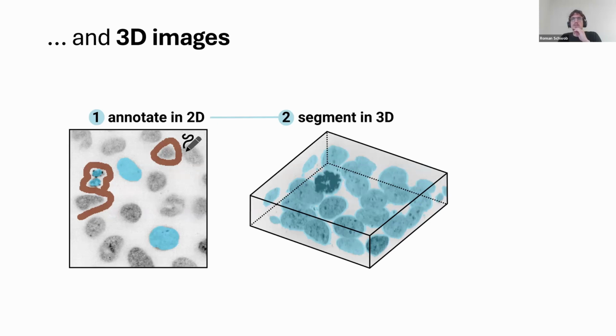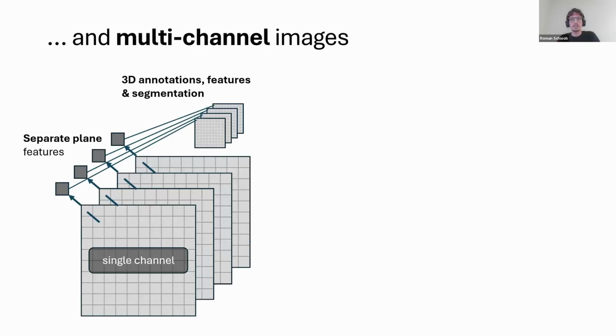And one thing that I think is really important for you to understand if you're working with Convpaint, and basically in segmentation or image analysis in general, is what it actually means when an image has multiple channels. It's really important to differentiate between a normal 3D image and a multi-channel image.